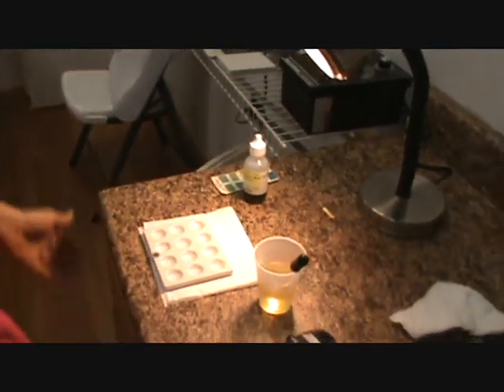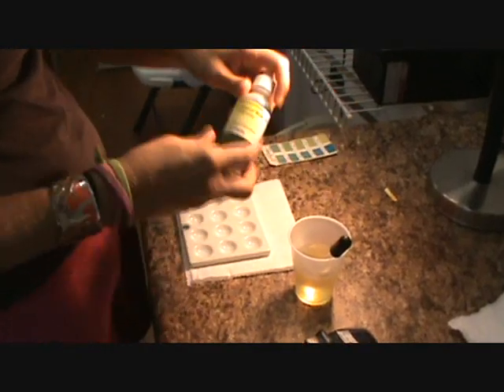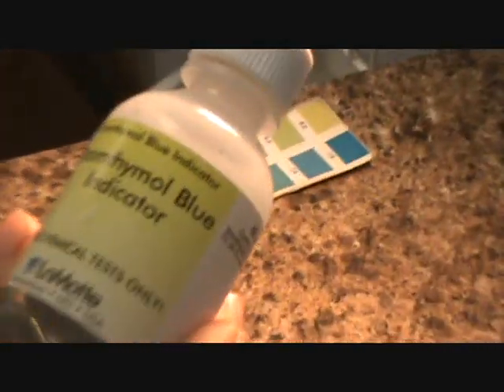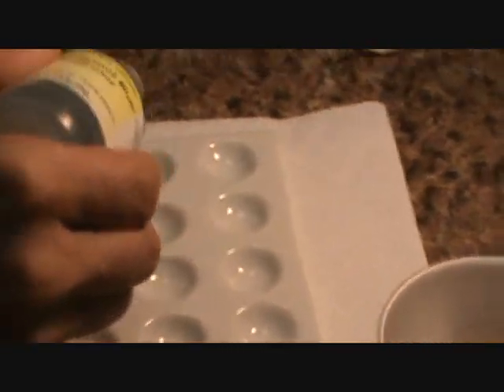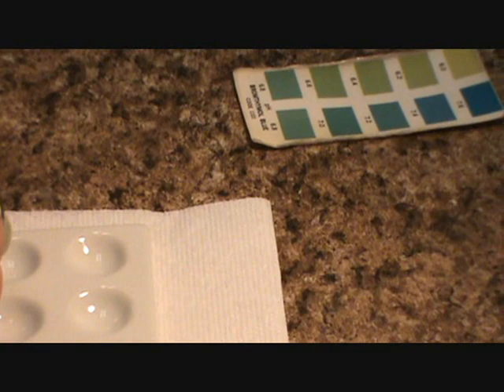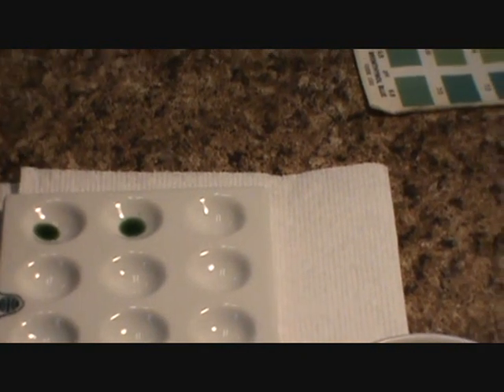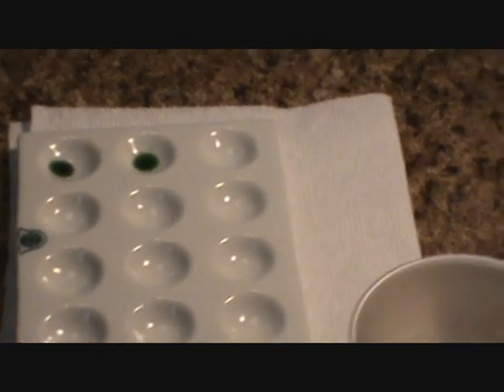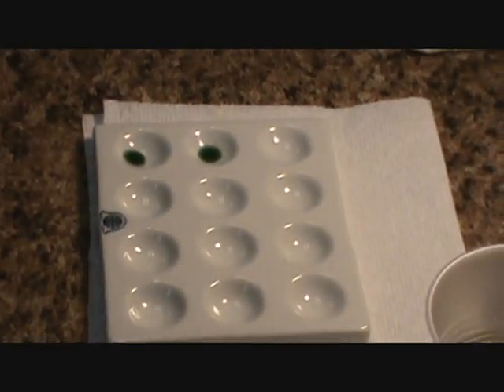Can you do the pHs for us here too? So for pHs, you're going to take one drop of the bromothymol blue indicator and put one drop in well five and also one drop in well fifteen. You don't have to know the numbers of the wells — just put a drop in those little dishes.